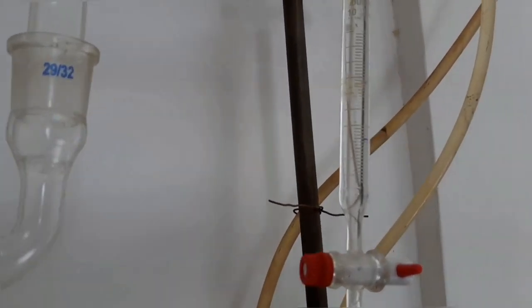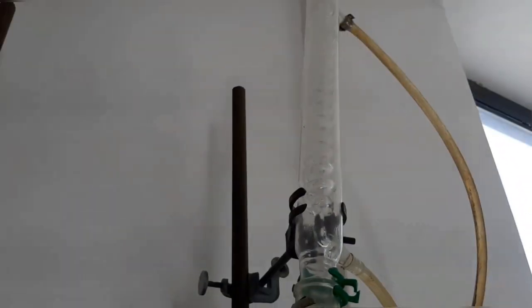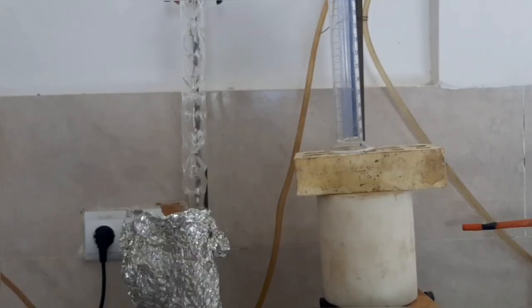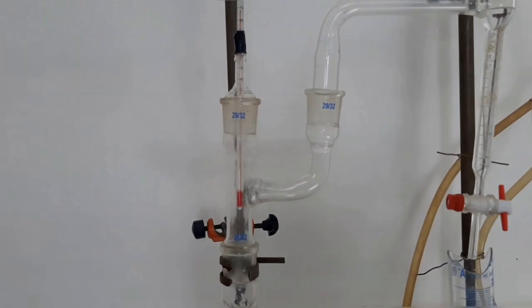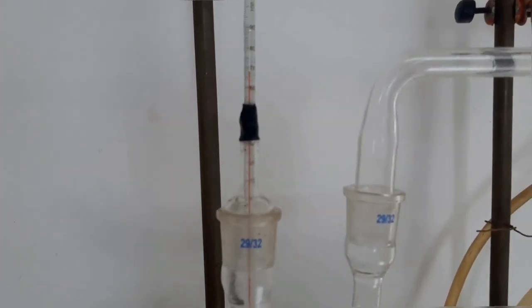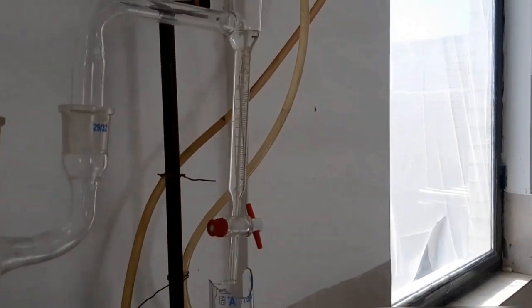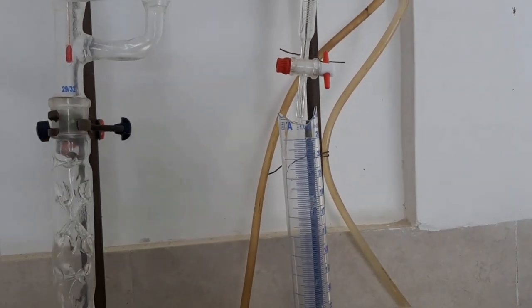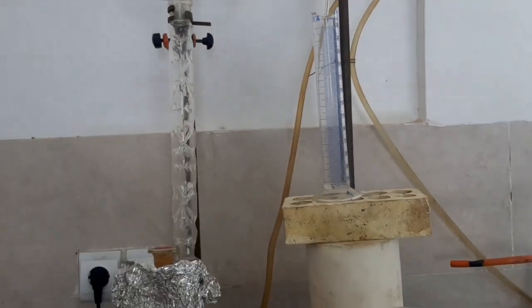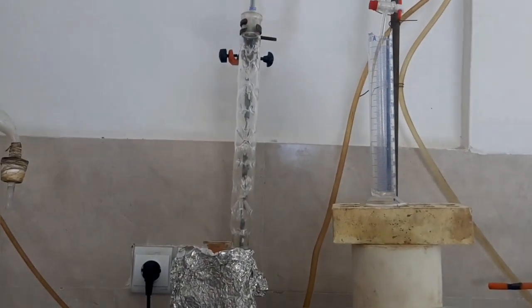The Dean-Stark is refluxing some of the mixture. Actually, here it's refluxing all of the product. It's a total reflux. So we do a total reflux at the beginning of the reaction for about 45 minutes to reach the equilibrium, which is the 60% mark. After a while, we open the valve of the Dean-Stark apparatus to collect some product. The degree of the collection of the product, the ratio of the product to the reflux, is indicated by the temperature of the overhead product.